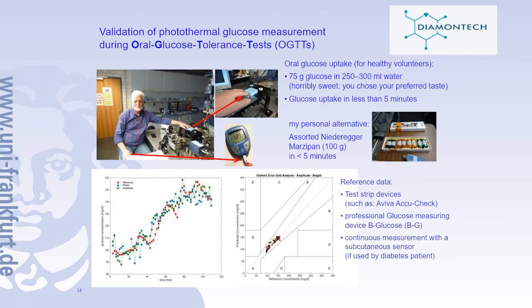You see me here at the optical bench. My left hand here is put on the sensor, and the skin of one of the fingers of the left hand is used for non-invasive measurement of glucose. And at my right hand, we do the control measurement with a commercial glucometer used by diabetes patients. And my task here is to modify my blood glucose.